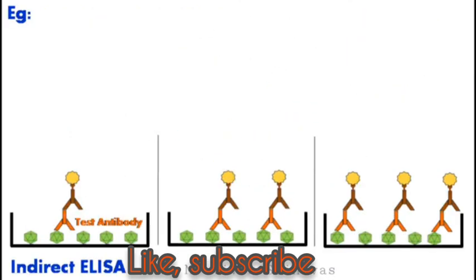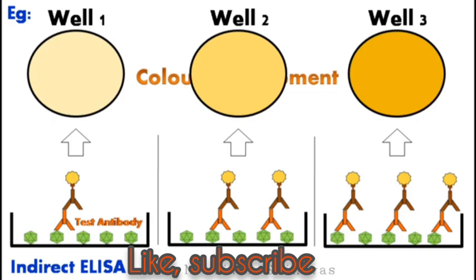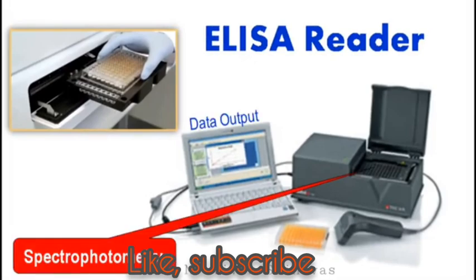The degree of color development completely depends upon the quantity of antigen or antibody in the test sample. For example, in this indirect ELISA, the lower the antibody level, the lesser the color development, and the higher the antibody level, the more color development. How is this amount of color development measured? It is measured by an instrument called ELISA reader, which works with the principle of spectrophotometry.